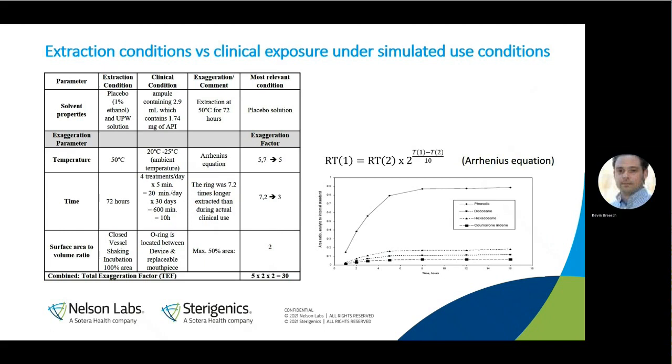Time, we extracted 72 hours. Let's say as an example here, 4 treatments a day. You have to inhale it for 5 minutes. So there is an exposure of 20 minutes a day.